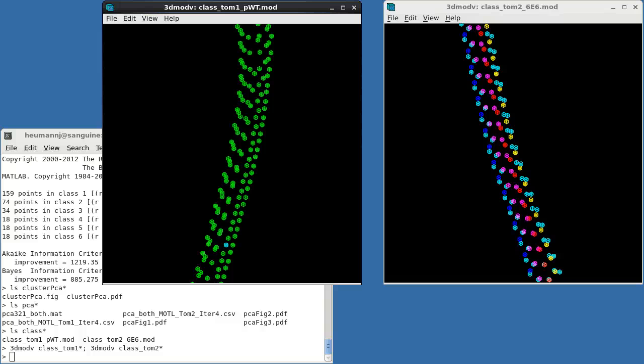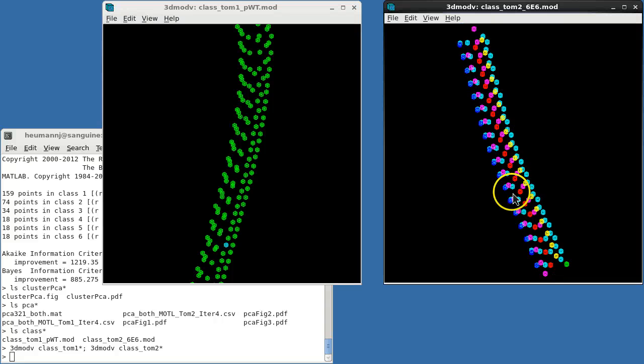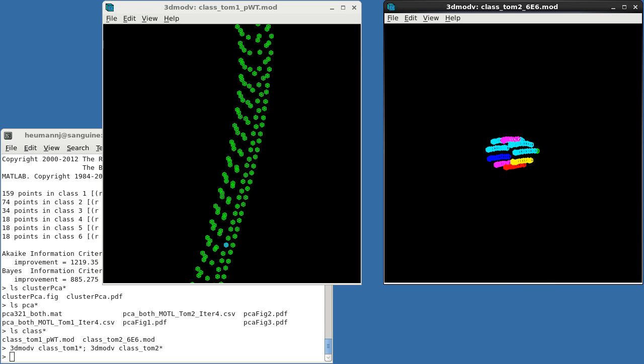Let's open these with 3DMODV and take a look at our results. First, note that class 1 corresponds almost perfectly to pseudo wild type, while the remaining classes are distributed among the 6E6 mutant. Results like this strongly suggest that class 1 is quite distinct and should really be aligned and averaged separately. Of course, we knew that to be true before starting in this case.